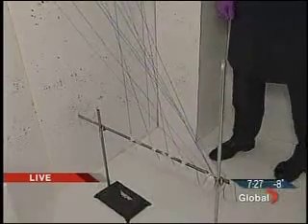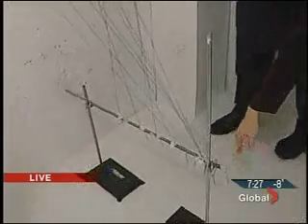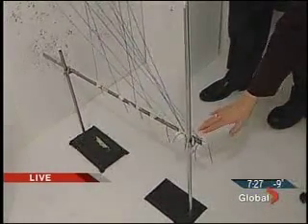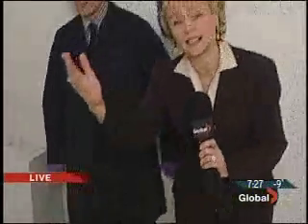Okay, we're out of time, but I have to tell you, Andrea and Shay, bottom line, the impact occurred when the victim was down here. That's the bottom line. Wow. So they know that the person wasn't standing up. That's where the head was. Very cool stuff. I couldn't really follow a lot of what John was saying because it's an exacting science, as you can tell.